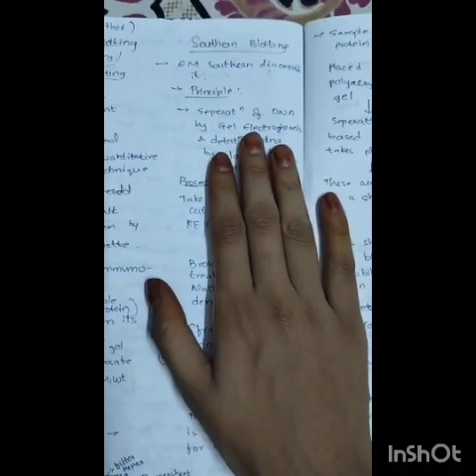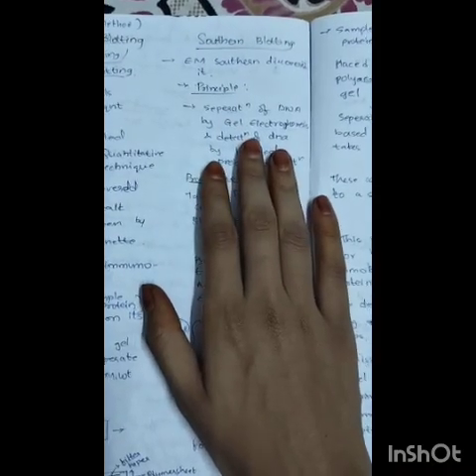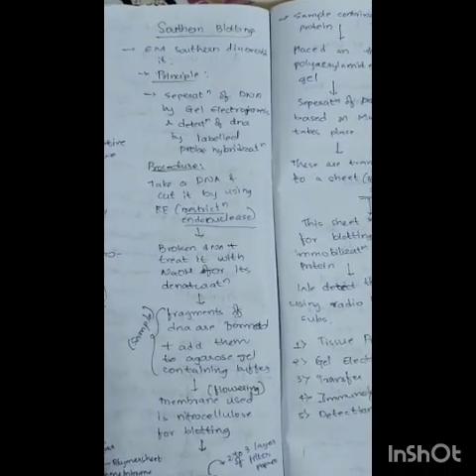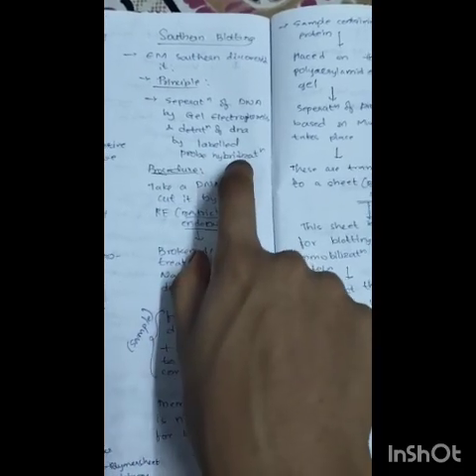Now we are going to study Southern blotting. Southern blotting was discovered by E.M. Southern, a scientist. It is used for the detection of DNA, and the principle involved is firstly separation of DNA by gel electrophoresis, and then detection of DNA by labeled probe hybridization.